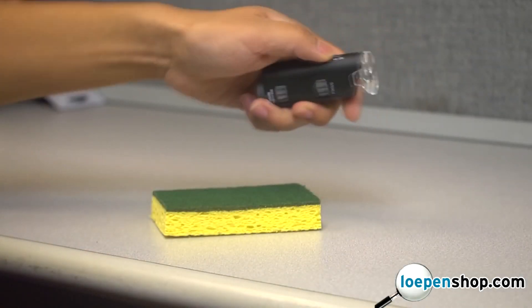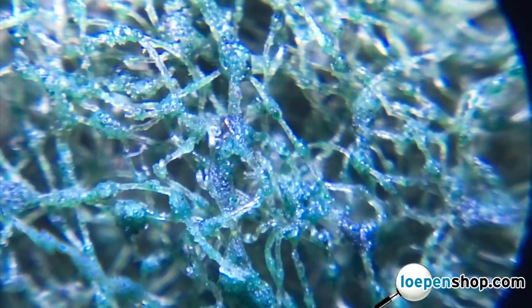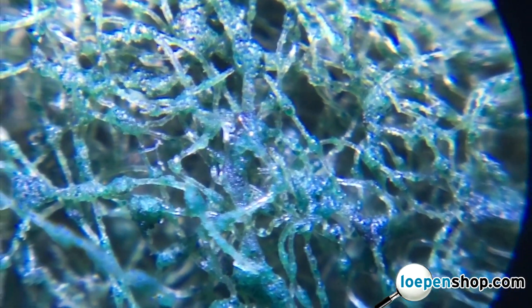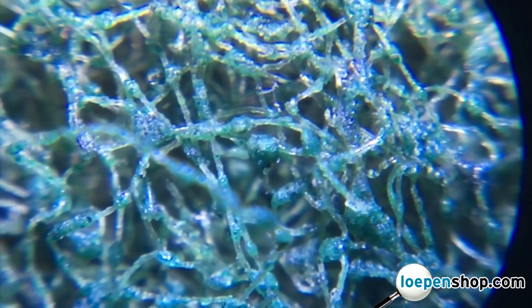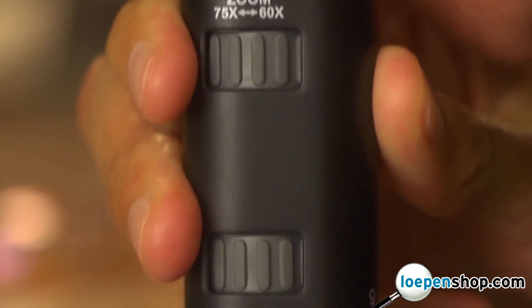Located on the side of the MicroMax is an on/off switch that activates the LED, allowing you to do microscopic research in any lighting condition. You can change the magnification by rotating the top ring, and then select your ideal focus with the bottom ring.